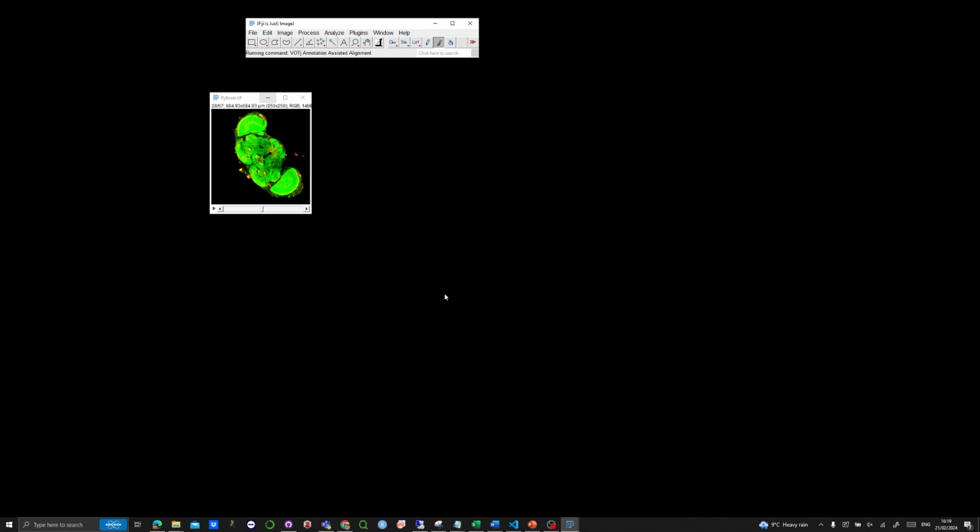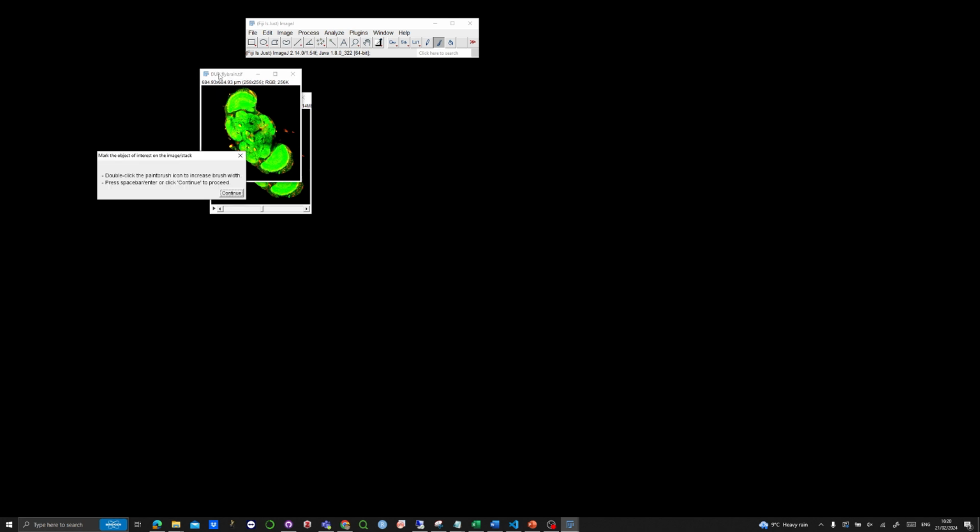fly brain. So first we need to select the image as the annotation assisted GUI pops up. Now as we have a stack here, the annotation assisted tool will ask if you want to go for single annotation mode or multi-slice annotation mode. If you select multi-slice annotation, you have to annotate each slice, but here I'm just selecting one slice. So I would go for single slice annotation. After selecting single slice annotation, I have to select the slice number on which I want to annotate. So I selected the middlemost slice.